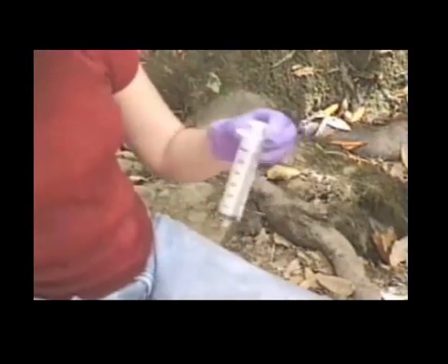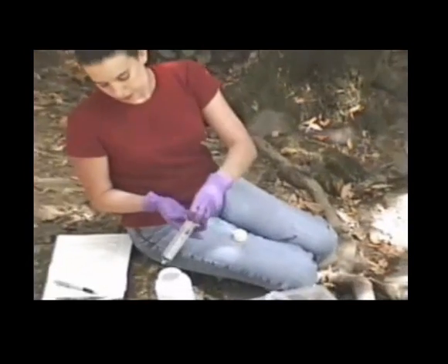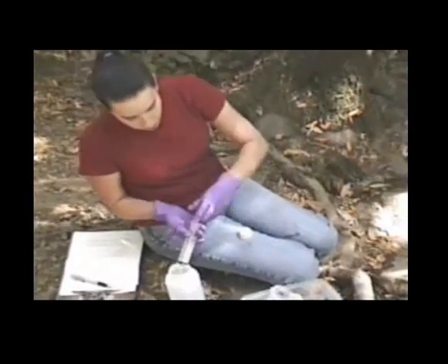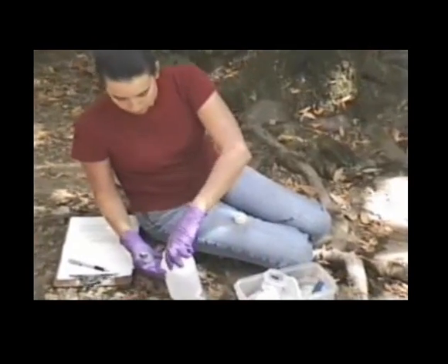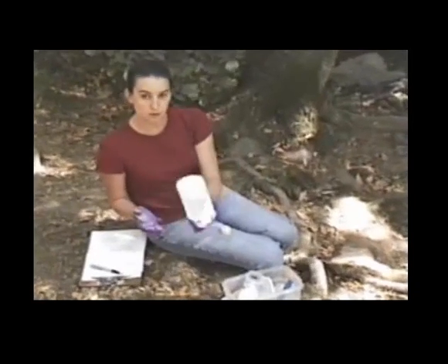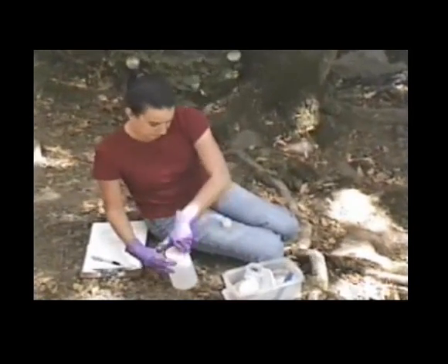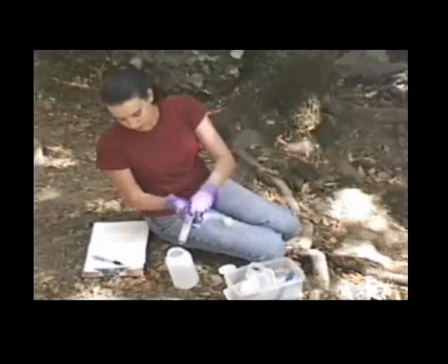And you want to take the syringe and get ready to filter your first 60 milliliters of sample. And you want to make sure you turn the sample through so it's well mixed. And you want to do that in between each collection.